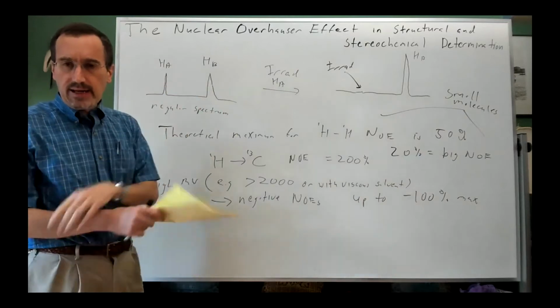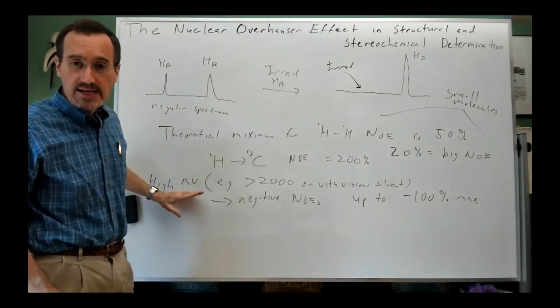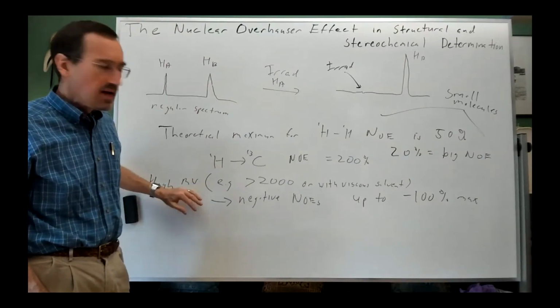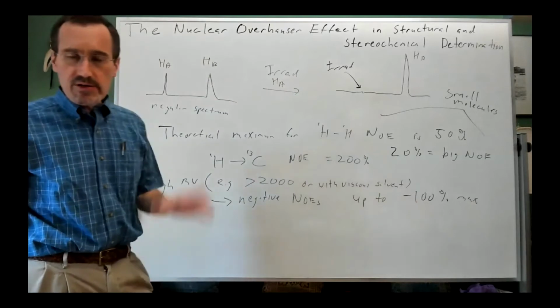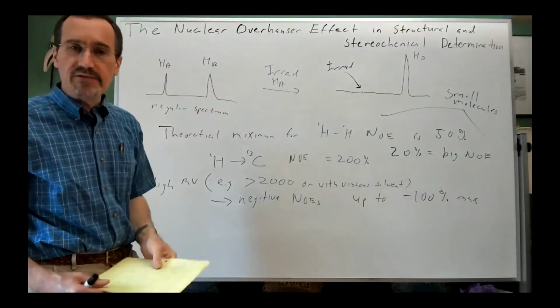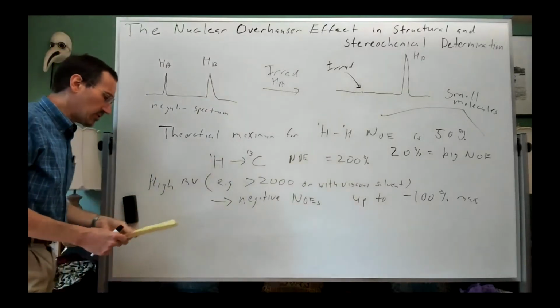In biomolecular NMR, where the molecules are high molecular weight, i.e. proteins, RNA, DNA, and other biopolymers, the NOE signals are so big that often you can pick up distances that are even bigger, sometimes even up to 5 angstroms, or at least greater than 4 angstroms.